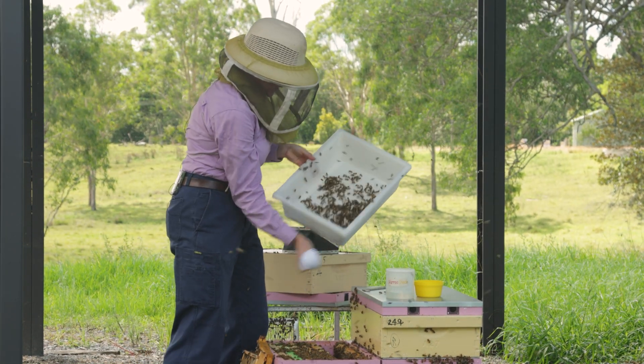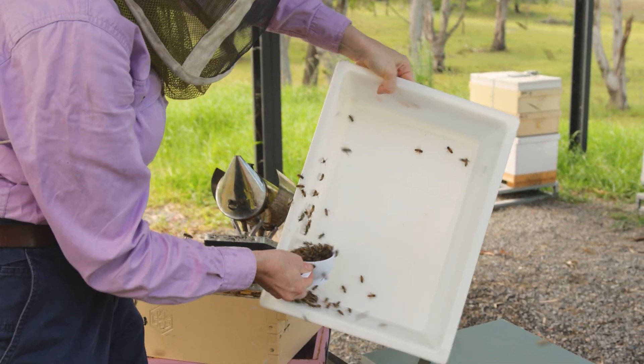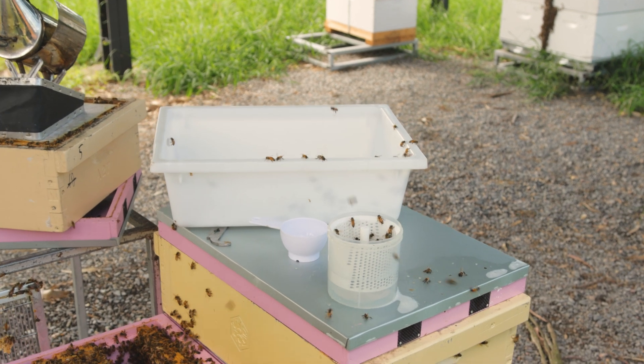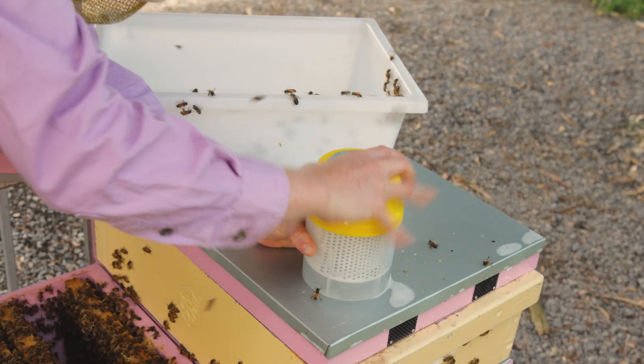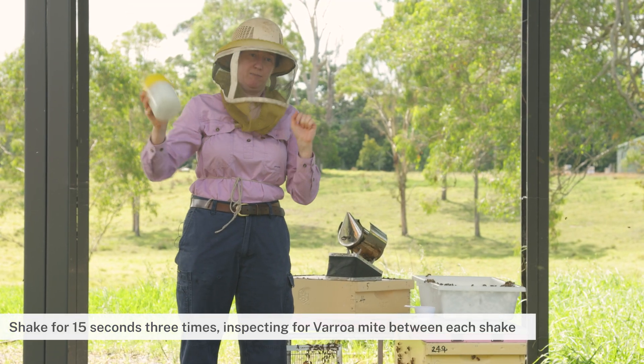So I'll shake the bees down to the corner, grab my half cup of 300 bees, close that quickly, and then I'll get into my sample shaking routine, which is shaking for 15 seconds three times.